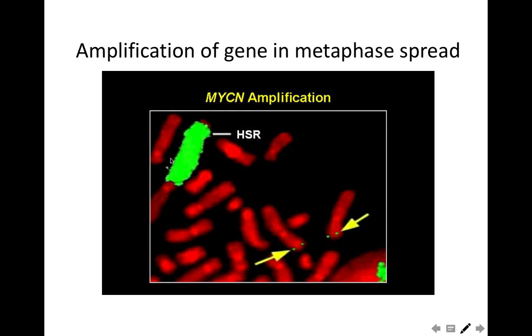But here you can see all this fluorescent patch is quite big in comparison to this spot. Right? Much bigger, very wide. It means there is very high amplification for this gene. So this is also another gene which has a role in cell division. And when it is amplified, this can happen in some types of cancer, and it will be diagnostic for the genetic change of certain cancer types.